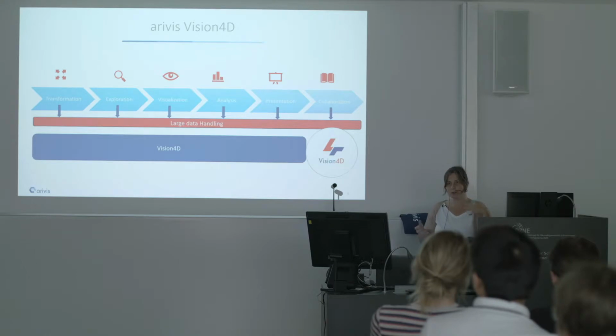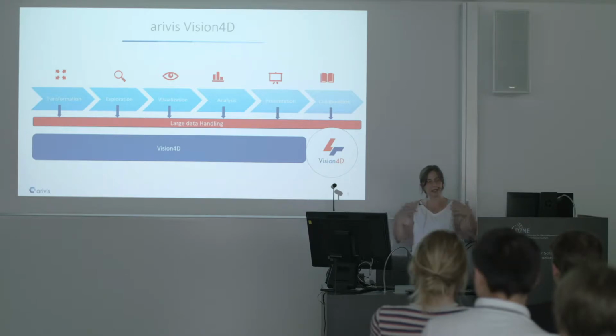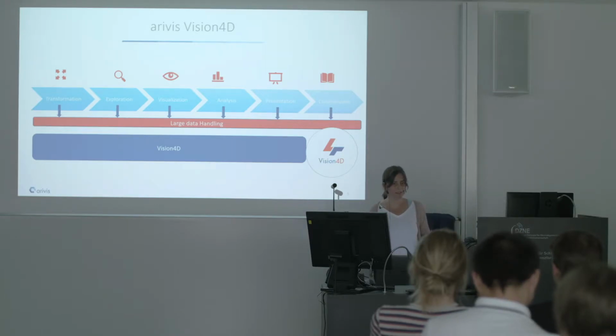We do so by providing a software which would run also on standard PCs, which allows you to handle even a terabyte of data, and which would always be interactive, setting up, for instance, analysis routines, or being interactive in creating animated movies.